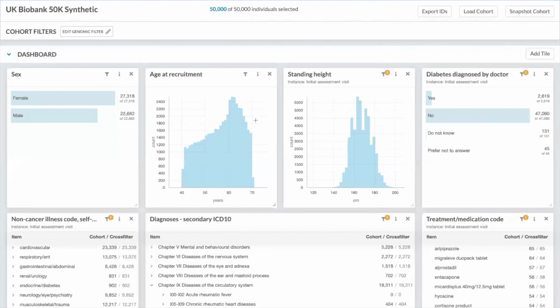Thank you, George. Next question is asking about the software used to call variants, and also asking what the depth of the whole exome sequencing is. Right. Great questions. Again, I think that's a question for Regeneron, as they're the ones that are in charge of the pipeline. I believe they're using GRCh38. They're doing mapping with BWA and variant calling with a couple of different pipelines. One uses a variant caller called WeCall, and another that uses GATK.